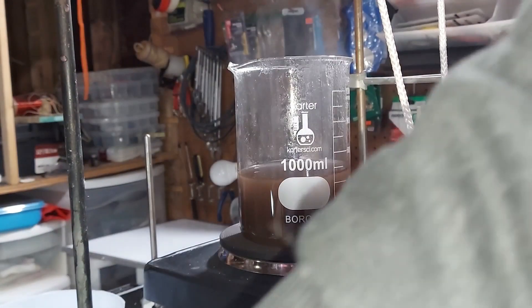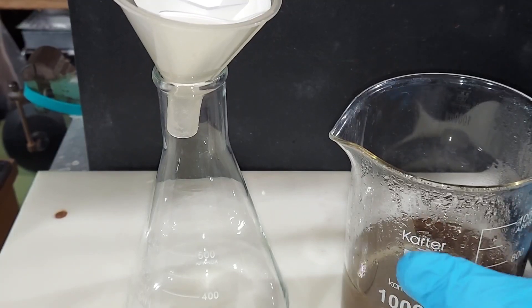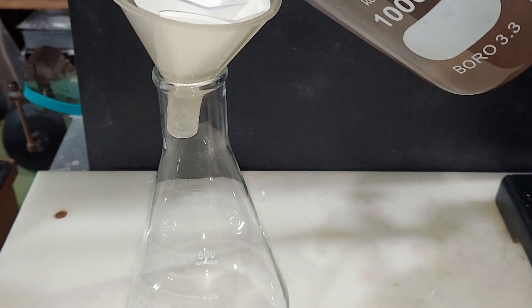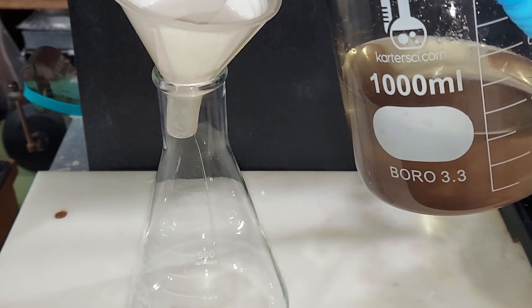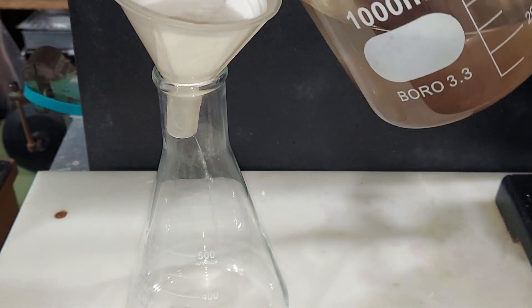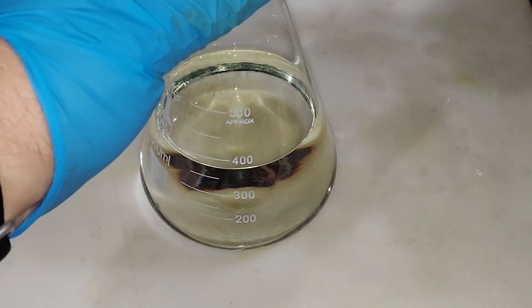There we go. I'm going to turn down the temperature — we need to filter it next. This cooled down enough, it's time to filter. As is typical, this is going to take some time. Fortunately most of the crud went to the bottom so I can decant a lot of the top. It'll still go through the filter paper. I'll be back when I'm done.